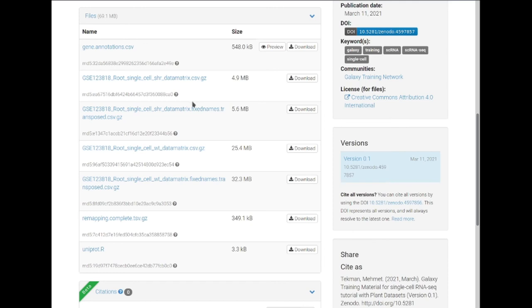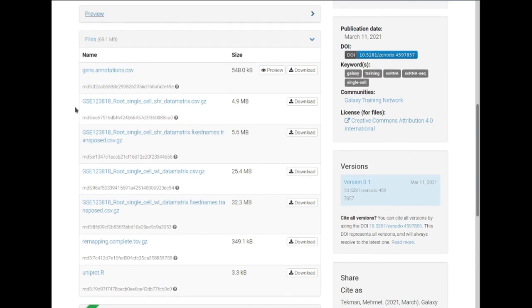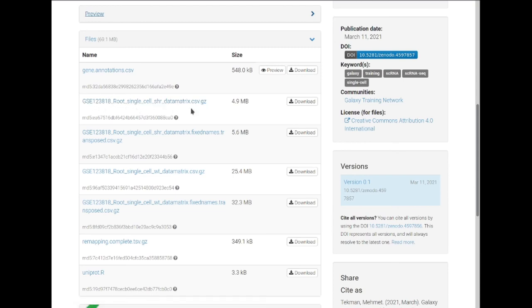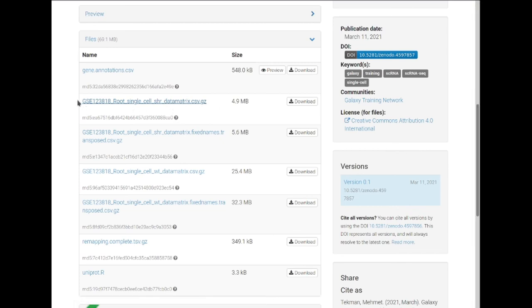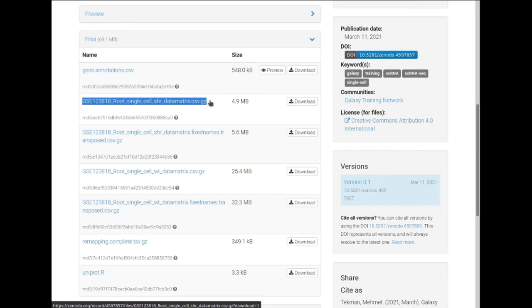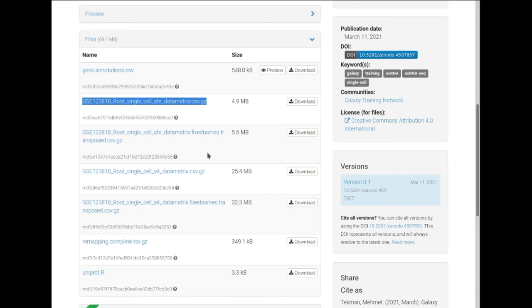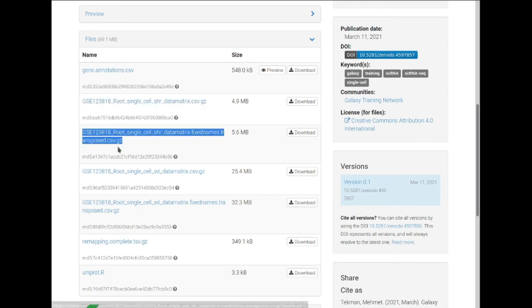This data was originally taken from GSE identifier 123818. However, I did have to change some of the gene names and transpose the matrix, which is why you have this new extension of 'fixed names and transposed' from the original dataset. If you wish, you can work with the original dataset, but it is recommended to use this data matrix for better, more meaningful names later on.